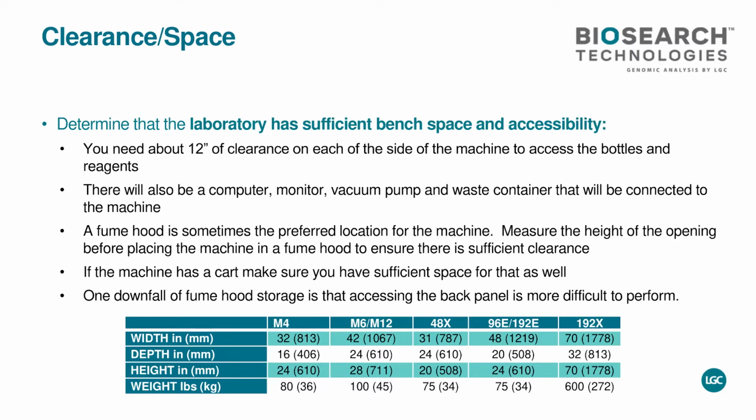At the beginning it will be okay, but you cannot be in a room and be like that around the synthesizer. No, you need space. So when you set up, think about that: the space for your synthesizer, the space for your HPLC, your QC. Like that you will work more smoothly.